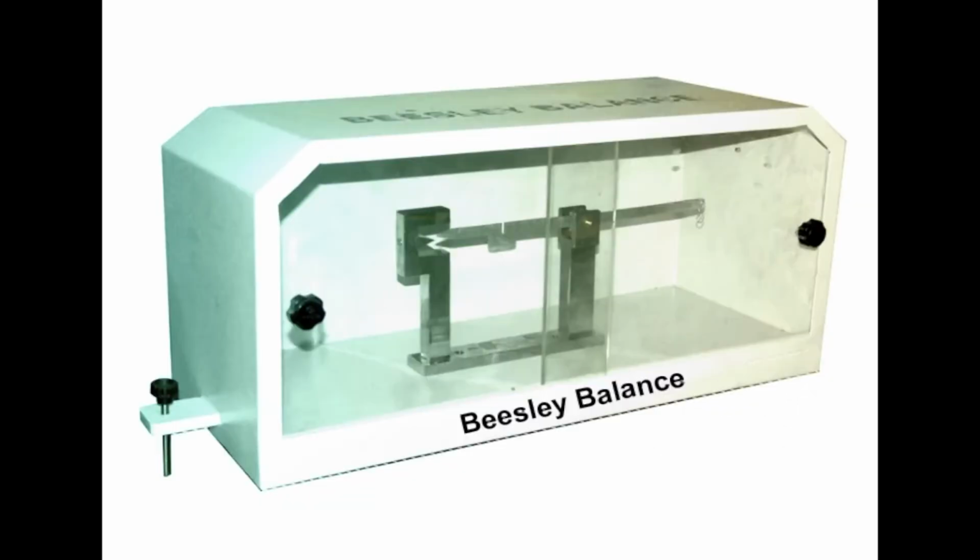When the standard weight is put in, first it has to be leveled, and then a standard weight has to be put into the notch, and at that point you can see the pointer will be exactly opposite to the datum line on the scale. Now, at this point, after raveling out, the yarns are placed one by one onto the hook. When the pointer again reaches its original position, then you have to count the number of yarns, and from that we calculate the count of the yarn.